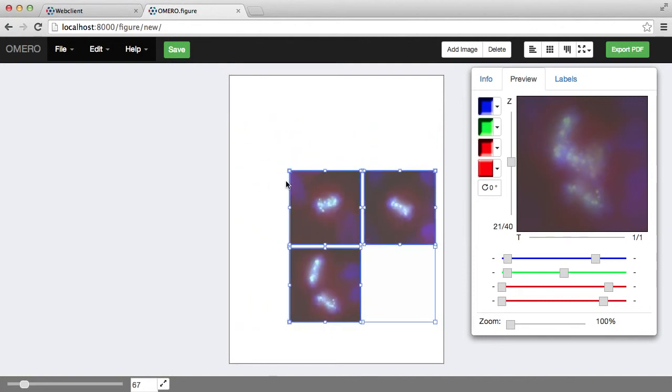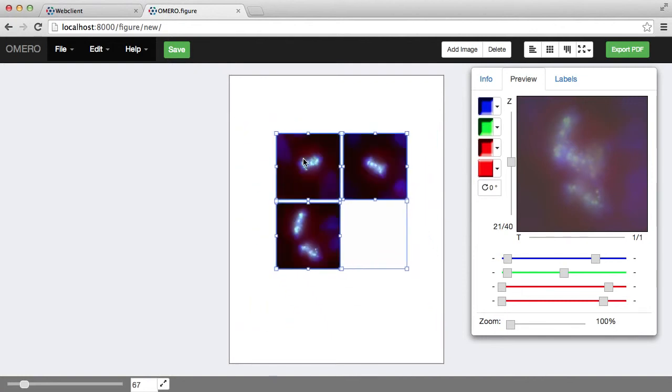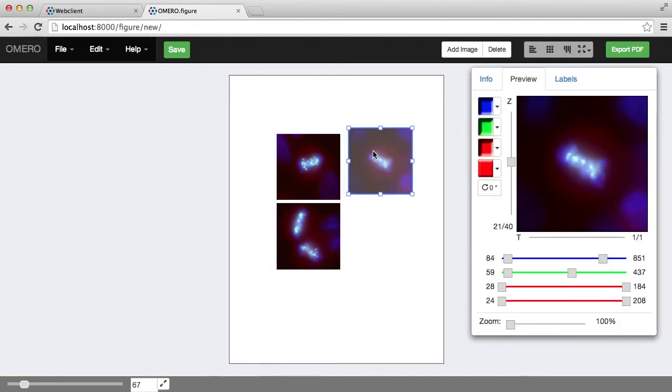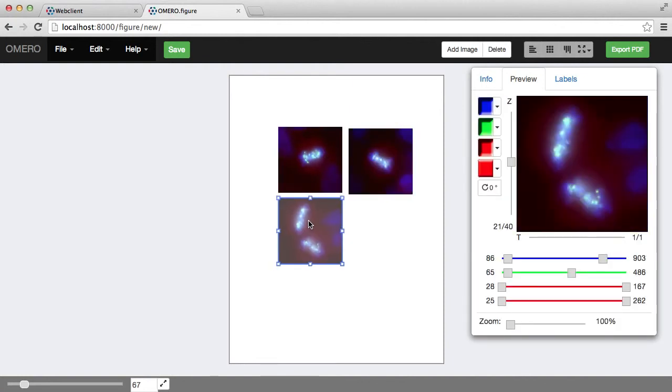So I can then select, drag, and resize these.